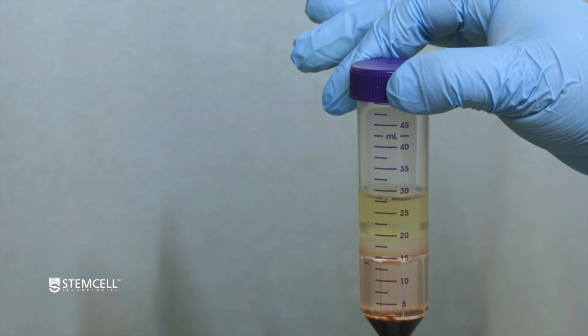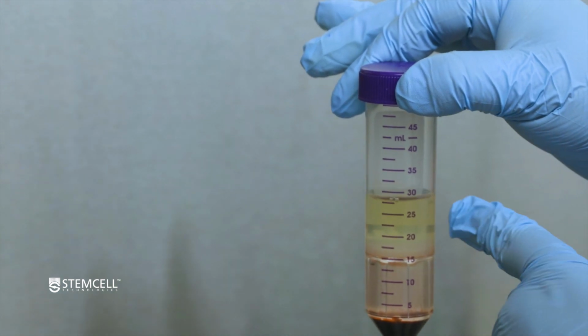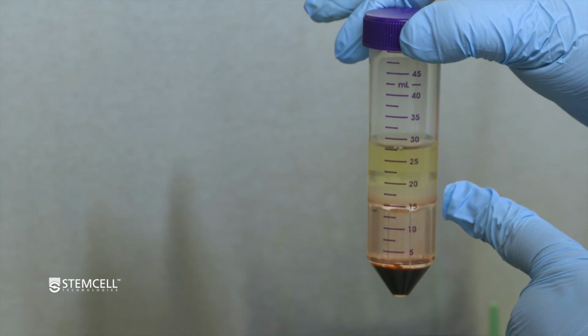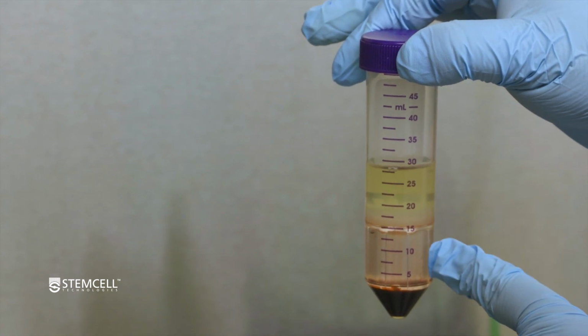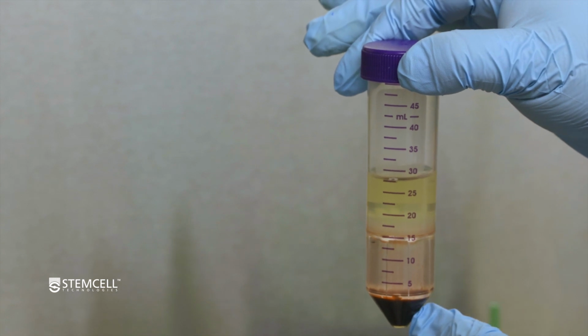So you'll notice that after you take your SepMate tube out of the spin, that you're going to have this yellow diluted plasma layer at the top. Then you're going to have this slightly hazy white layer, which are your desired peripheral blood mononuclear cells. And then just below that, you're going to have the density media plus your red blood cell and granulocyte pellet at the bottom.